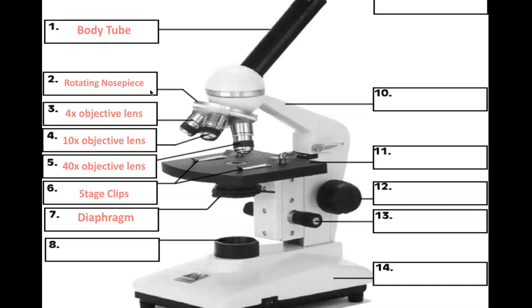And if we have a whole bunch of light making its way through that stage into our slide, we're going to find that we can't see some of those objects, and we're going to really have trouble identifying things. So reducing the overall amount of light moving through the slide is often important, and we do that using the diaphragm.